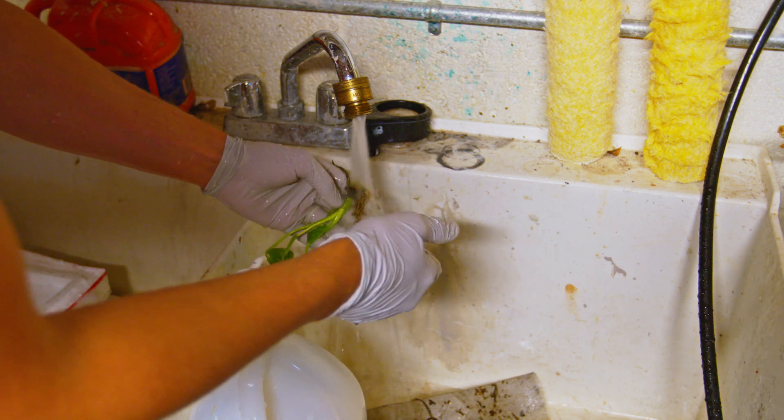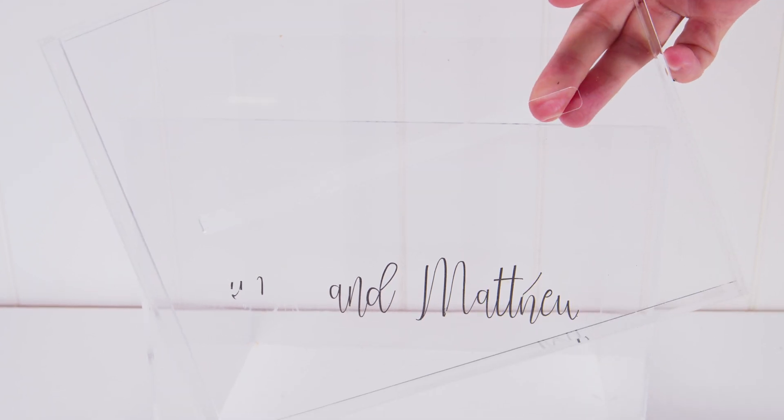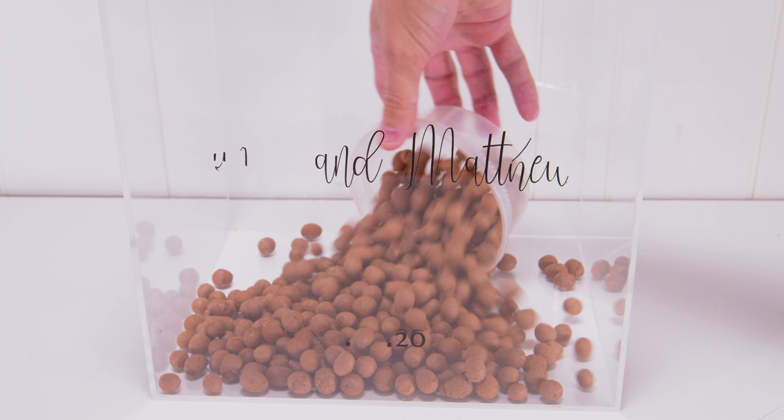The most important thing is not really sanitizing your stuff, because it's already sanitized coming out of a tissue culture. It is getting all the agar off thoroughly — it's so important. If you want to use a fungicide or what other companies like Growth Revolution recommend, there's nothing stopping you, I just did not do that. Once you've got them deflasked, we need a new place for these. I would highly not suggest just potting them up and setting them out — they will instantly die.